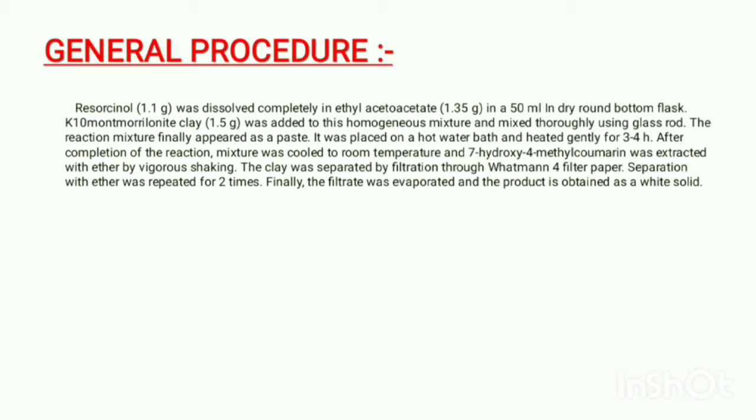After the completion of the reaction, the mixture was cooled to room temperature and 7-hydroxy-4-methyl coumarin was extracted with ether by vigorous shaking. The clay was separated by filtration through Whatman 4 filter paper. This extraction with ether was repeated 2 times. Finally, the filtrate was evaporated and the product was obtained as a white solid.